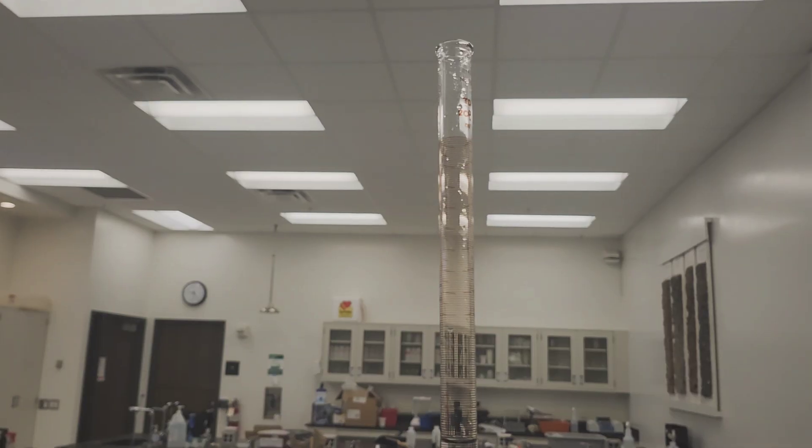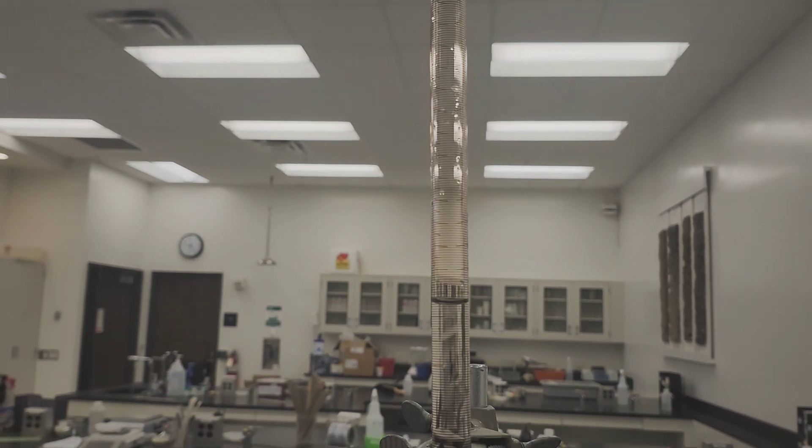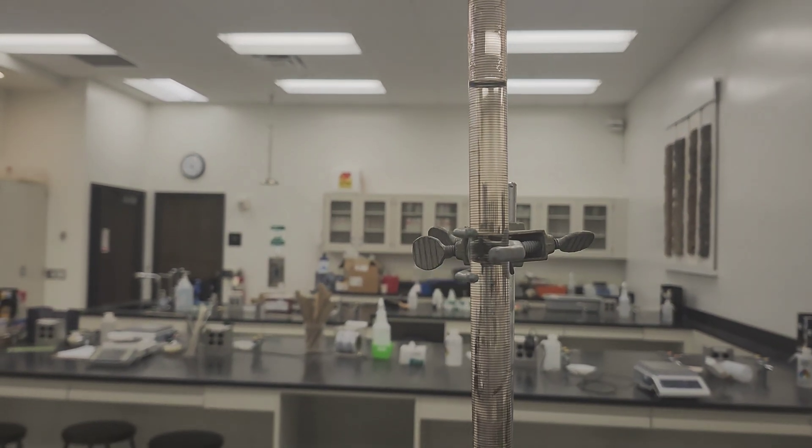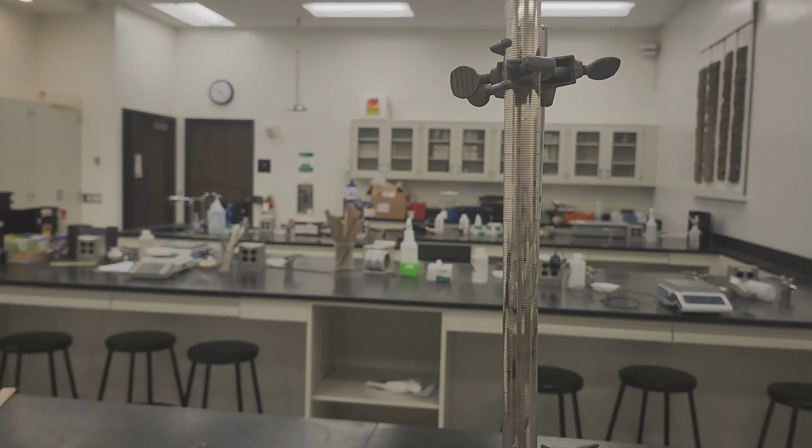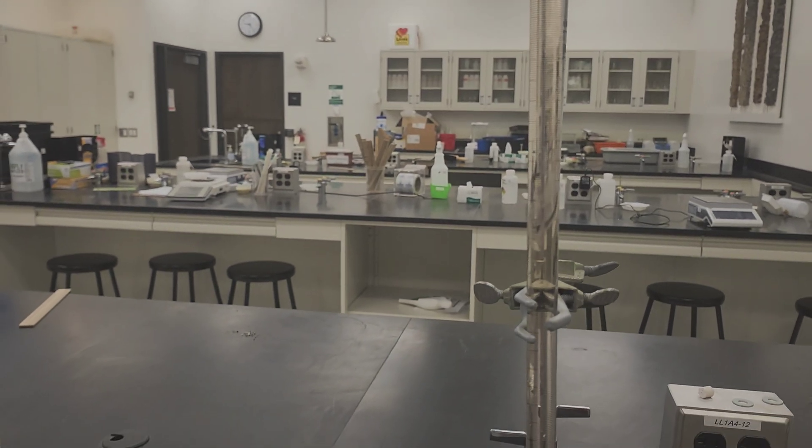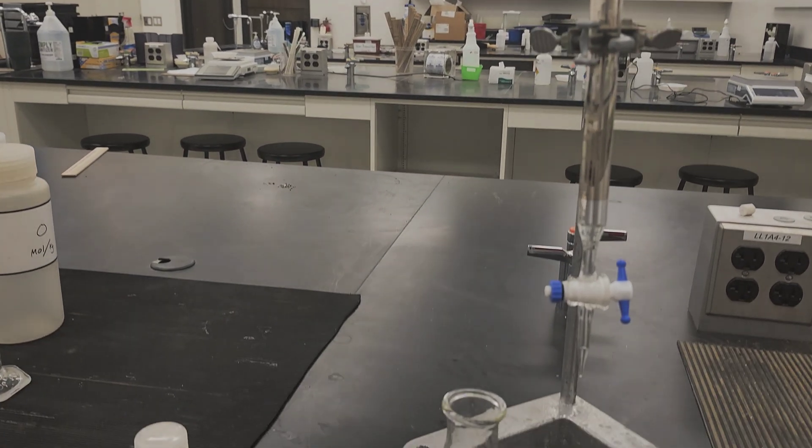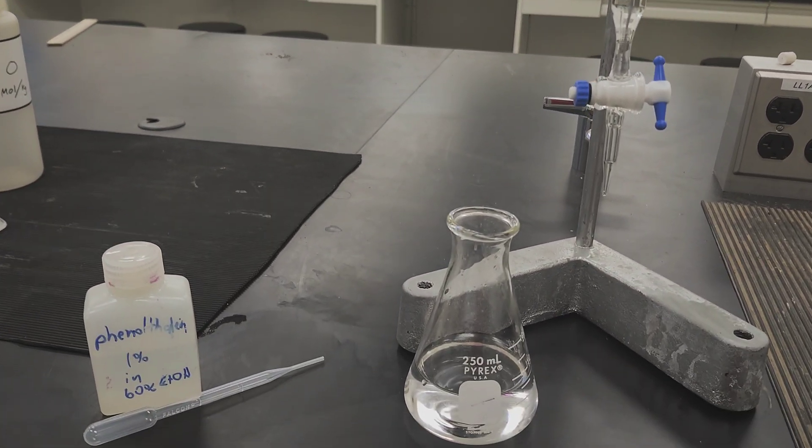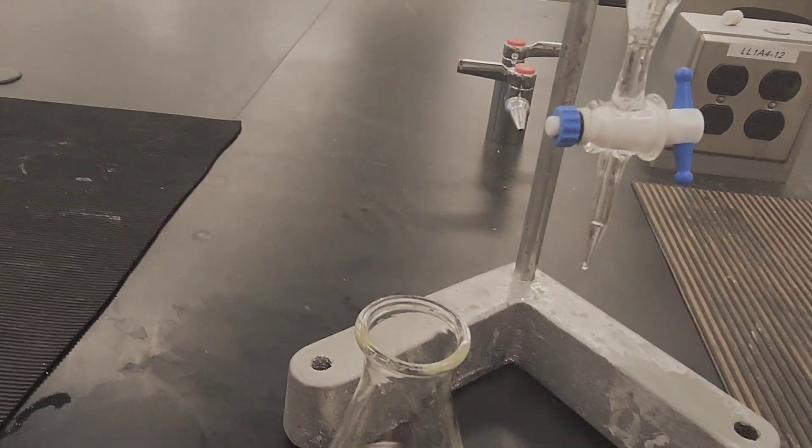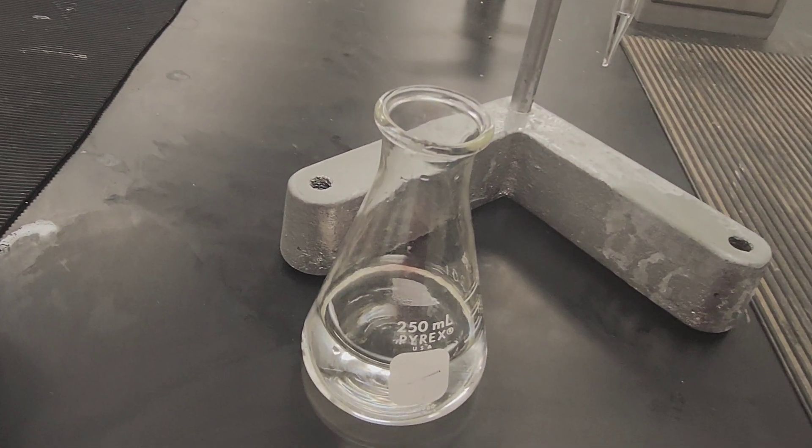The next step is titration. Before that, we need to add three drops of phenolphthalein indicator and we need to have a sodium hydroxide solution in the burette. Notice the color of the solution is transparent, and when we add phenolphthalein solution it still remains transparent.